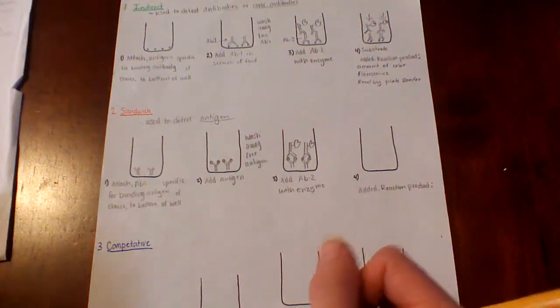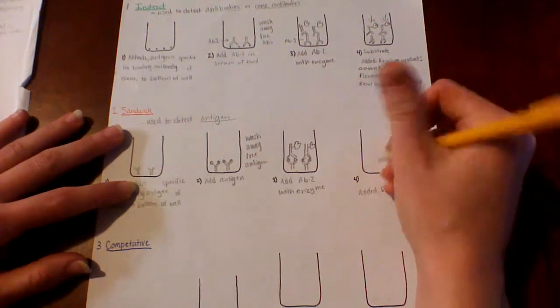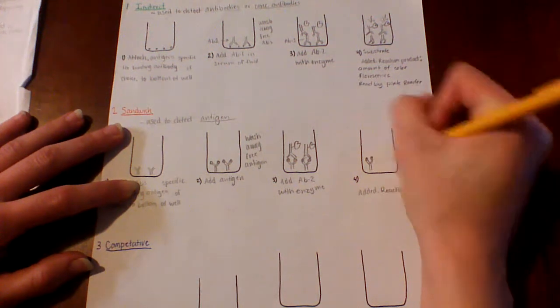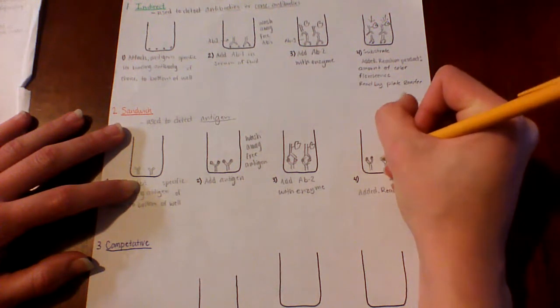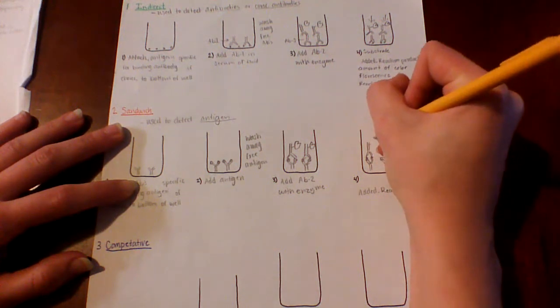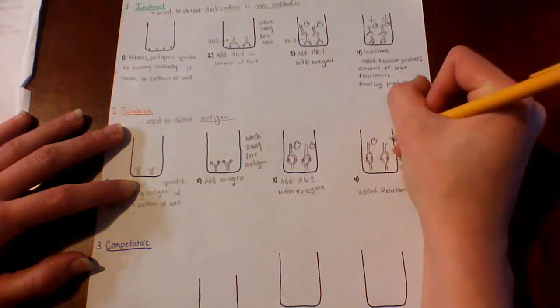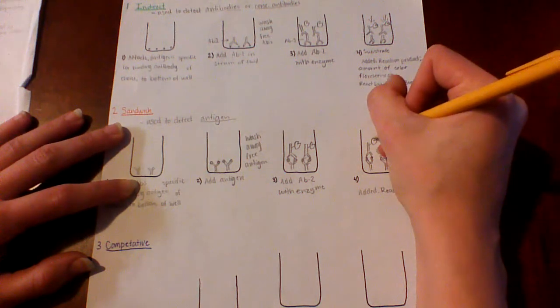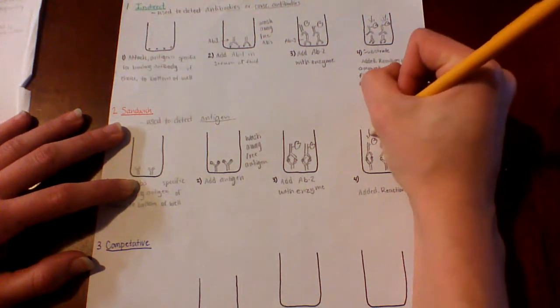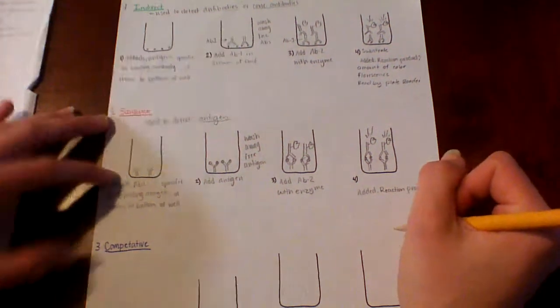So like in the step above, a substrate is added that is specific to the enzyme. So I'm going to draw the substrate bound to the enzyme here. And then the reaction product producing color or luminescence.